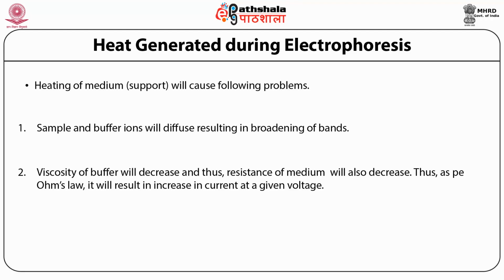So this becomes a continuous process if we do not control the applied voltage. Then more heat will be generated, and this generated heat will result in broadening of the bands.